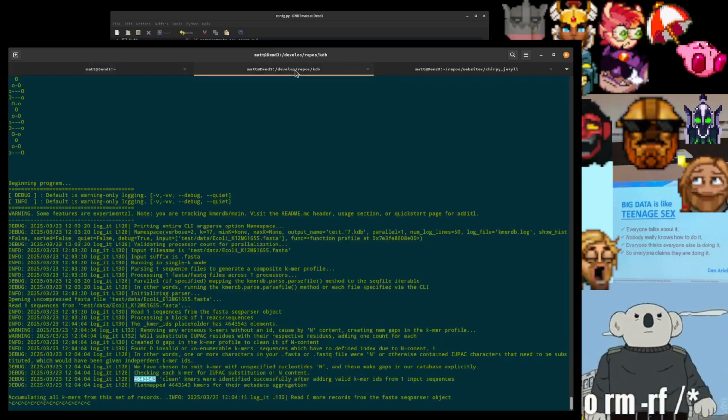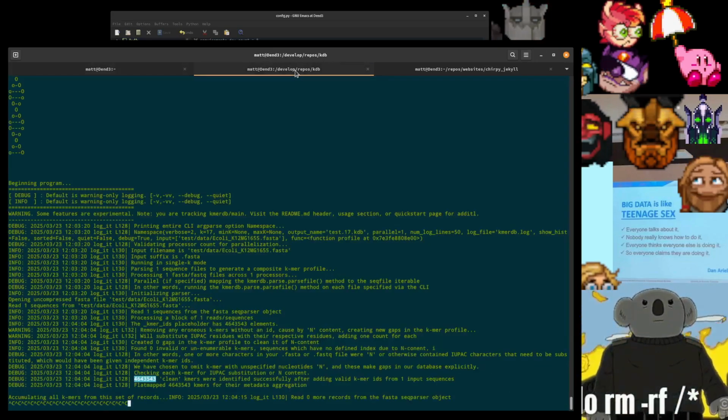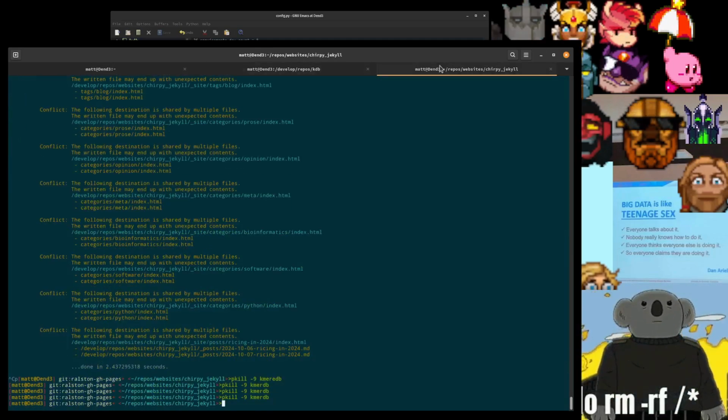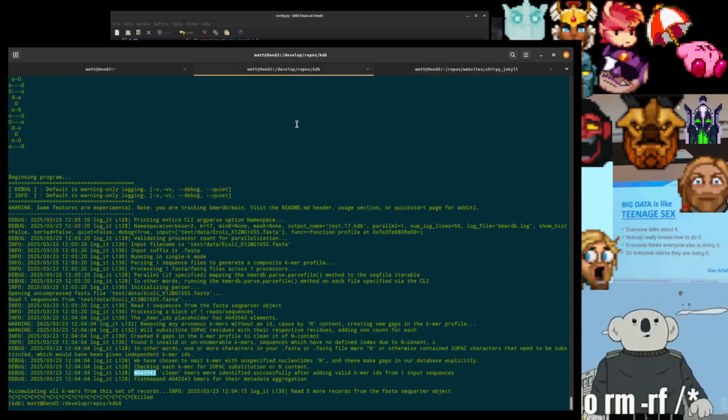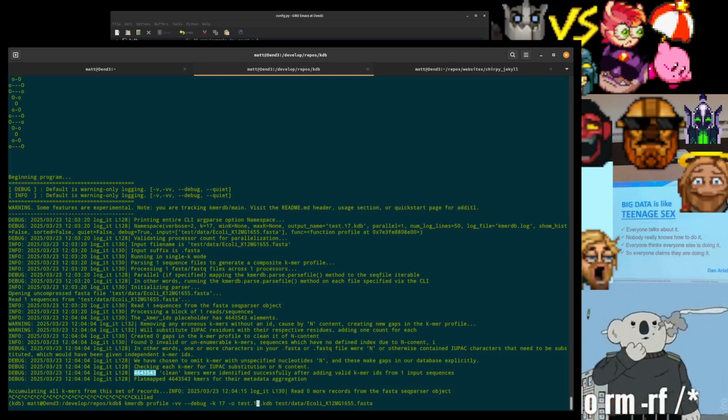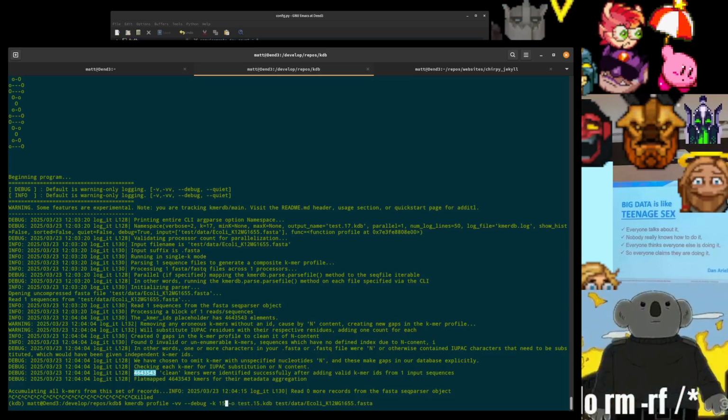Okay. Should be stopped now. Cool. Alright, let's try it again with 15. This will work. I've run this before.